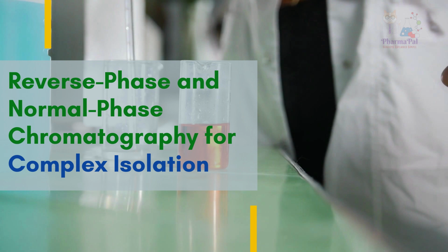Now, let's apply this knowledge to solve our specific problem of isolating and purifying caffeine, acetaminophen, and aspirin from a tablet. Step 1. Dissolve the tablet in a suitable solvent to get a mixture of all three compounds. A common choice is an organic solvent like ethanol, which can dissolve most organic compounds. After dissolving the tablet, we perform a liquid-liquid extraction. This process involves separating compounds based on their solubility in two different immiscible liquids, usually water and an organic solvent.